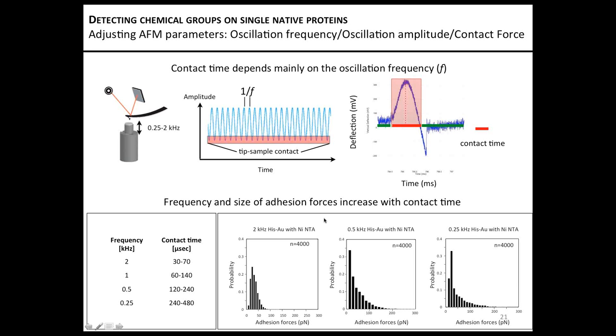If you go for lower oscillation frequencies, we increase the contact time, and we see already that we have increased adhesion forces.